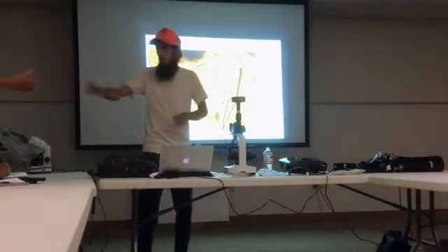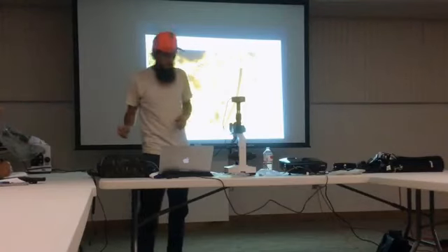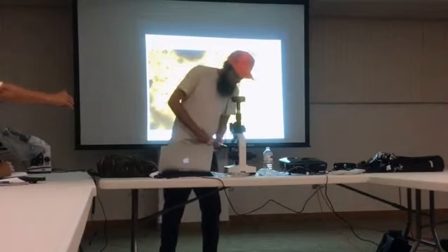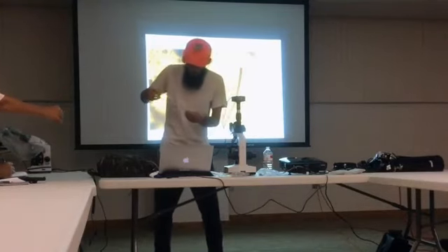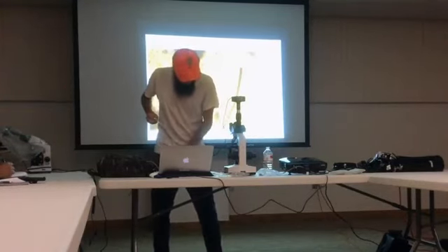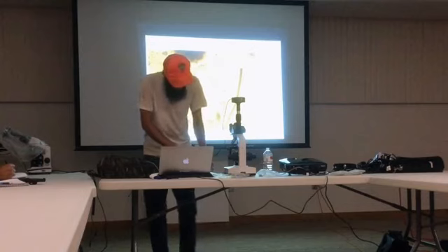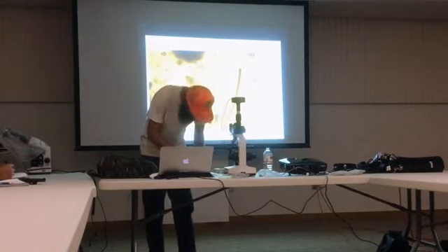Can you rinse that out? Yeah. Anything else you need to clean up? Actually, I brought a bunch with me, but no, I'm good. It's just one slide and you clean, but I got another one.